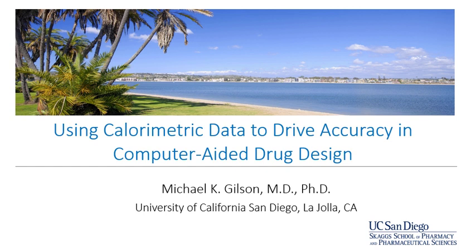Here's a scatter plot. We have both experimental and numerical and computational error bars here. And you can see that there's definitely correlation, but there's a fair amount of scatter. This looks a lot like what we saw for the protein ligand data, actually.